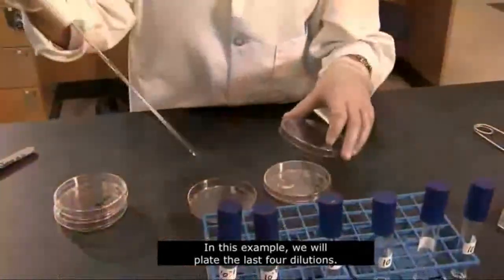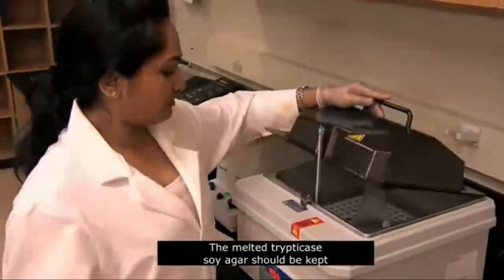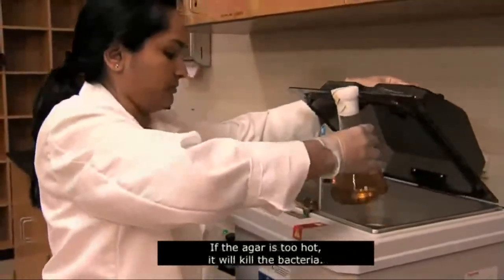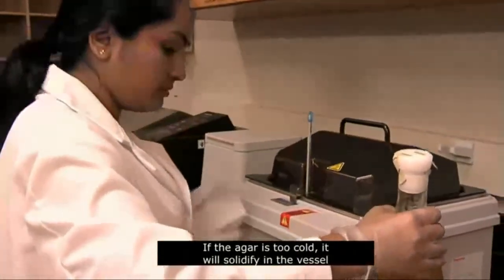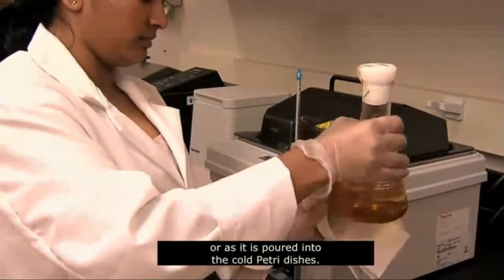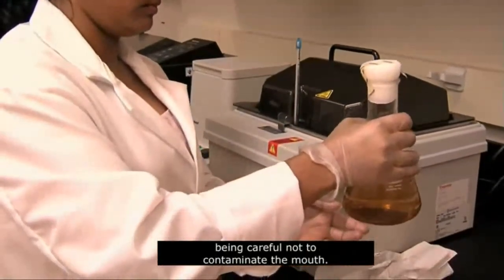In this example, we will plate the last 4 dilutions. The melted trypticase soy agar should be kept in a warm water bath between 45 and 50 degrees Celsius. If the agar is too hot, it will kill the bacteria. If the agar is too cold, it will solidify in the vessel or as it is poured into the cold petri dishes. Wipe the outside of the vessel with a paper towel, being careful not to contaminate the mouth.